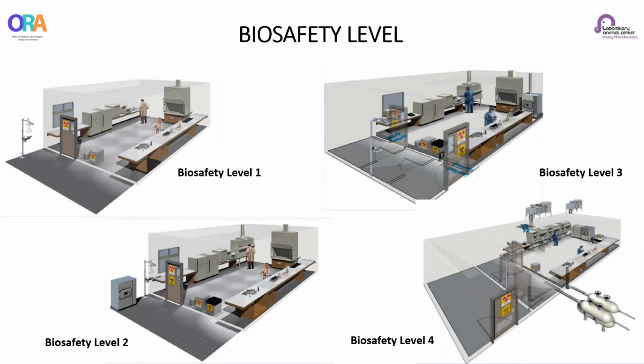A BSC, or biological safety cabinet, is used if the potential for generating aerosol exists. Personnel working with human-derived material should refer to the OSHA bloodborne pathogen standard for specific required precautions. Secondary barriers should include those previously mentioned in BSL-1.